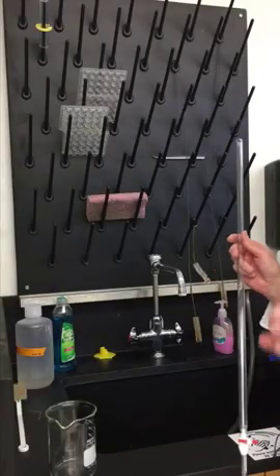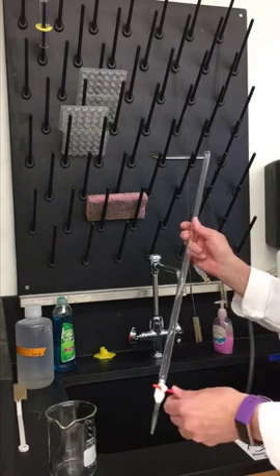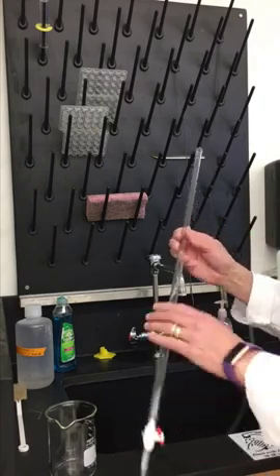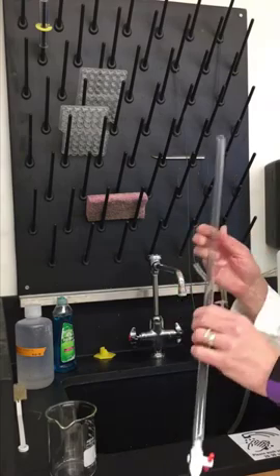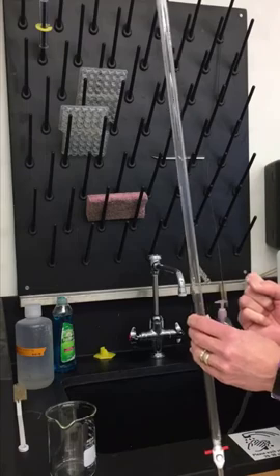I'm going to show you how to safely clean a burette. We need to make sure that no water adheres to the inside walls of the glass, because we want to deliver a particular volume of water.